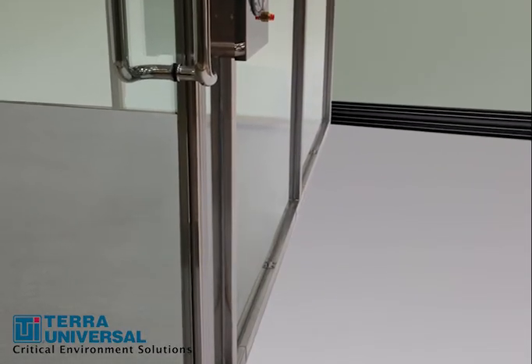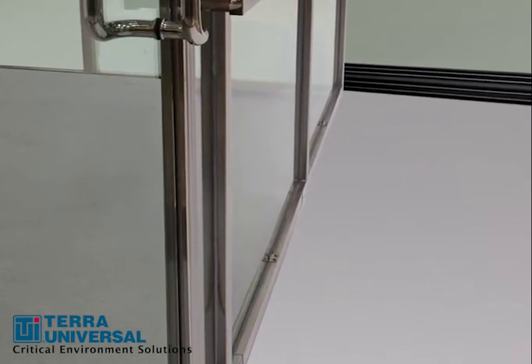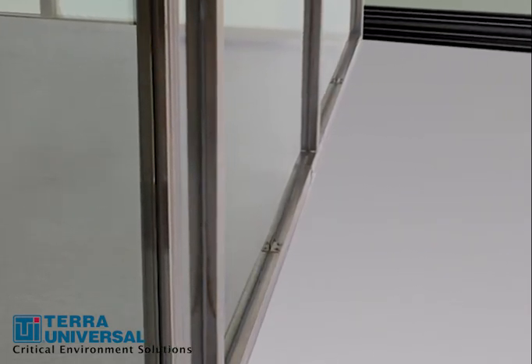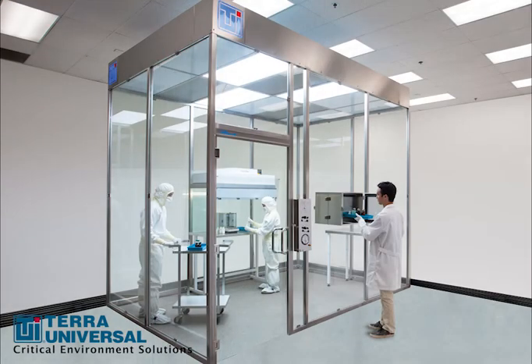Terra uses tempered glass panels for durability, safety, and maximum transparency. Panels are center-mounted to the 304 stainless steel frame using steel clips that sandwich the glass. No sharp hardware touches the panels. The steel frame features continuous welded seams that eliminate cracks and crevices where particles can collect.